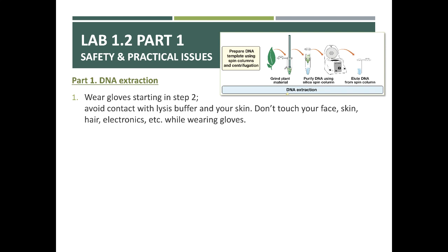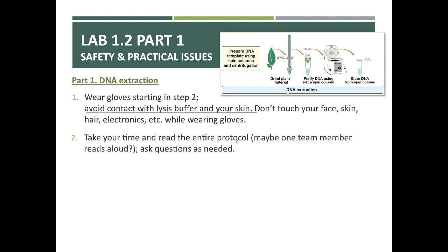So we wear gloves. Now, this is probably more obvious to all of you than in previous semesters, but when you wear gloves, you have to remember that you still are not supposed to touch your face. You're not supposed to rub your eyes, wipe your nose, or do anything like that. That's just the same thing as not wearing gloves at that point.